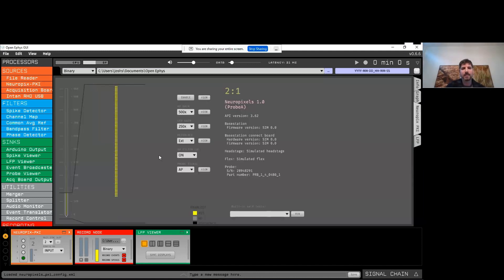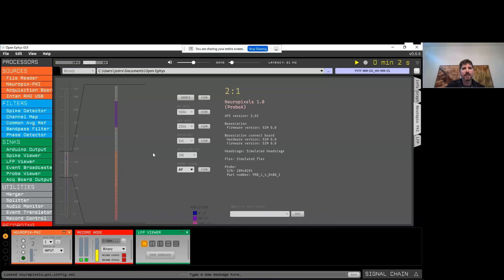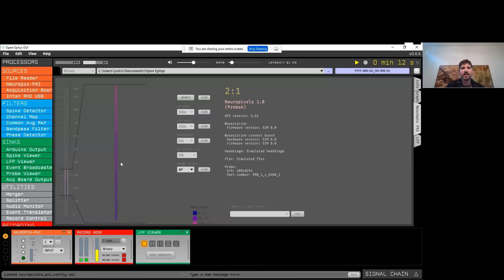Let's take a look at the Neuropixels interface. On the left, you have a representation of all 960 sites on the probe. The yellow ones are currently enabled, but we can select others and hit Enable — that will activate those electrodes and deselect ones connected to the same set of channels. You can also use this interface to change the gain of the sites or switch the reference from external to tip. If we switch into probe signal view mode and hit Acquire, we can visualize activity as a heat map across the active sites. This is simulated data, but in a real experiment you'd see the relative amplitude of signals across different sites.